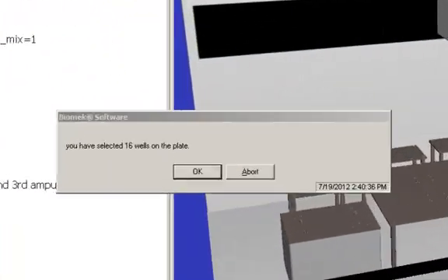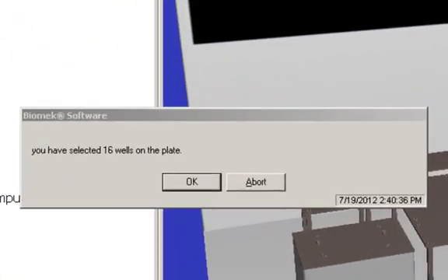And the third pause is basically just another pause telling you how many wells you've selected in your pattern. Once again, giving you a chance to end the method if you didn't set your pattern correctly. We just want to make sure give you one more opportunity to make sure things are set up correctly.